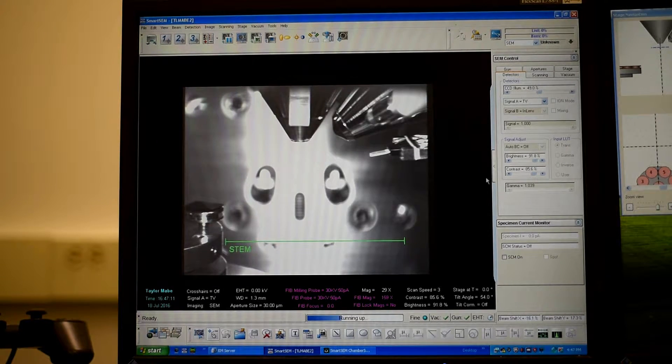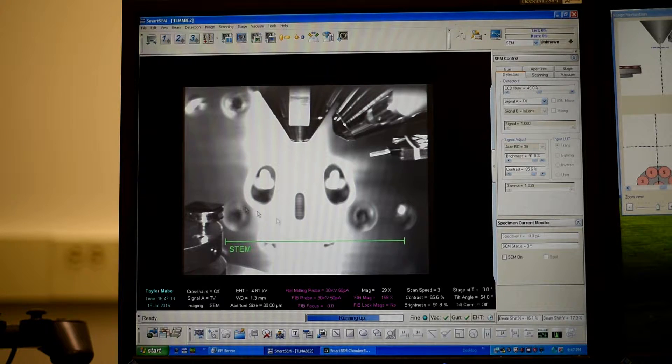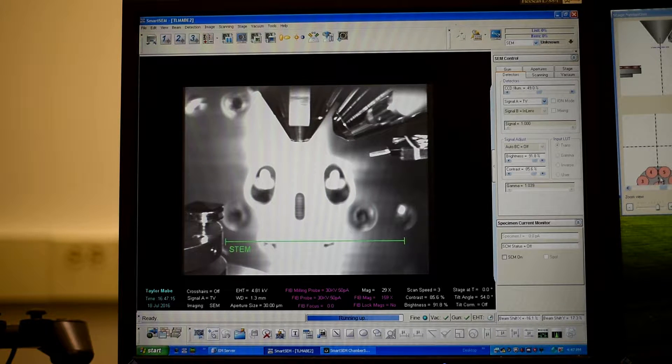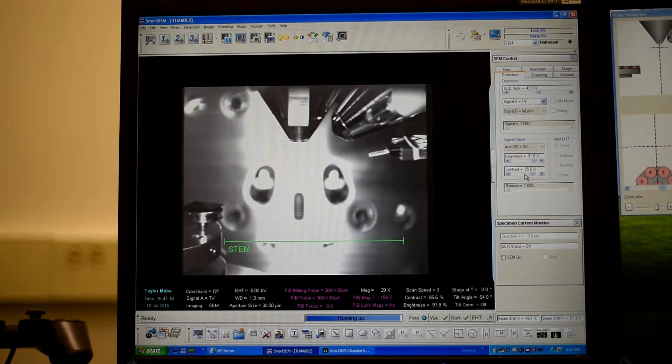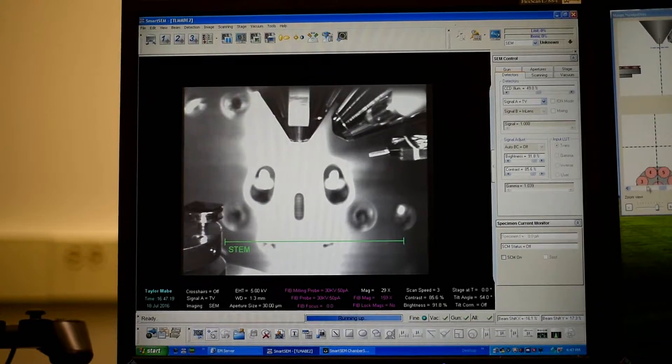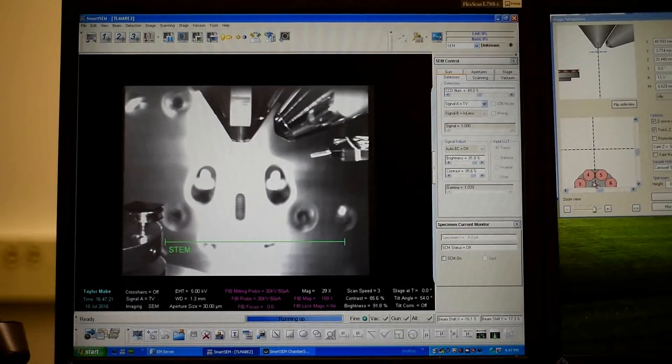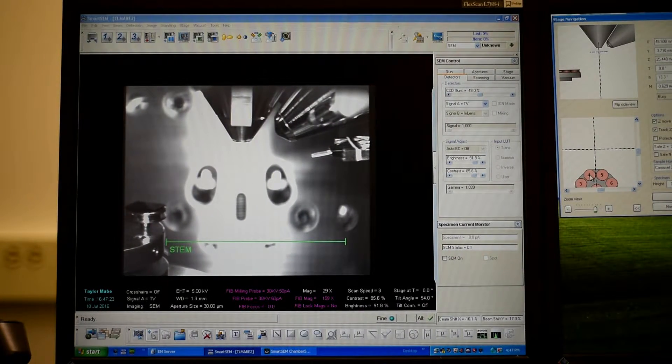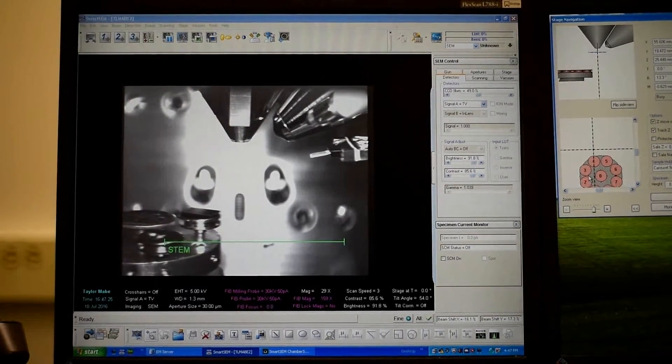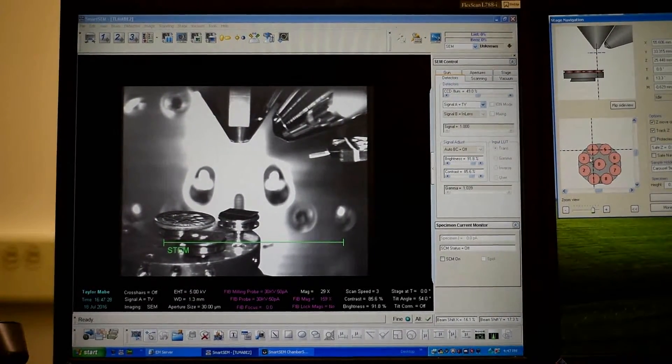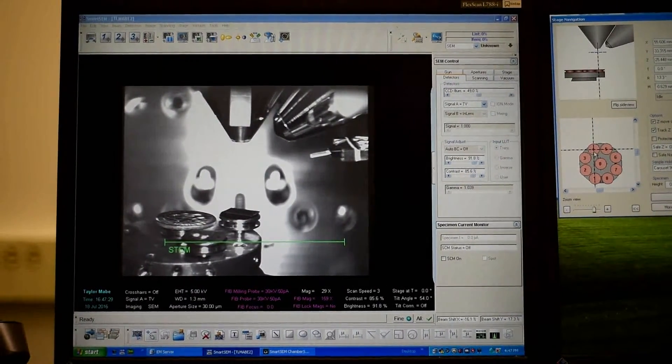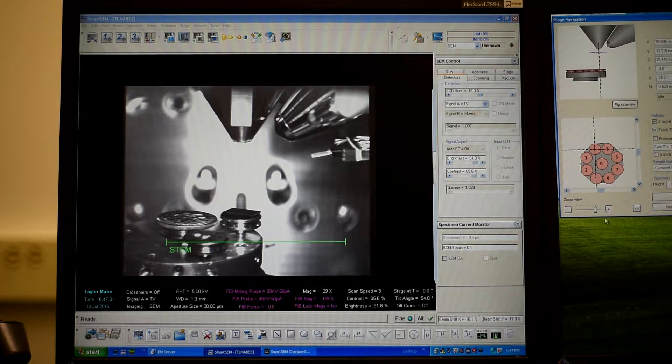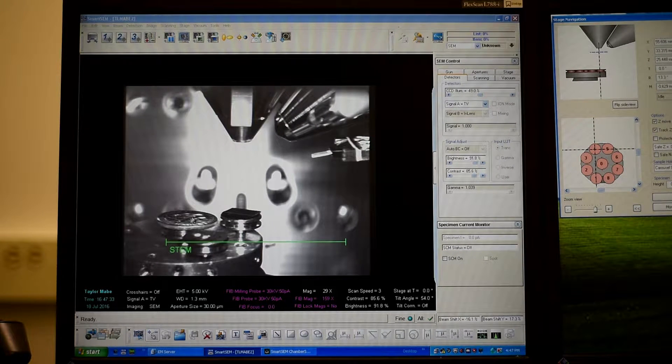And we can move the sample underneath just by double-clicking on the window right over here. So if you look at this window here, you can double-click any of the numbers and it will move your sample to that position. So we loaded the piece of silicon in space number four. So if I double-click that, as you can see, it moved.